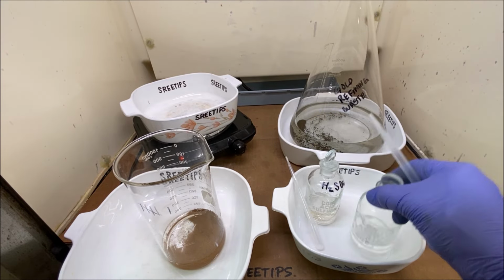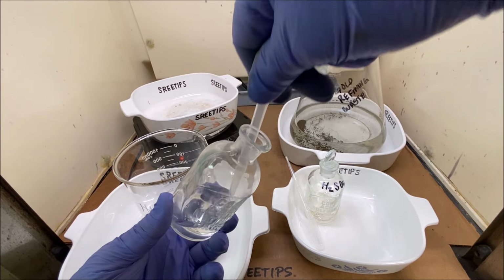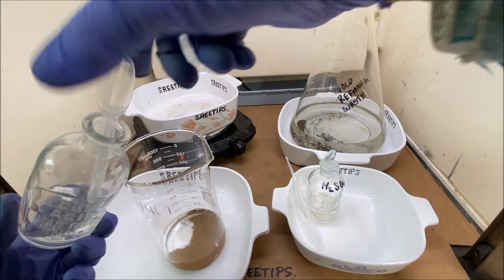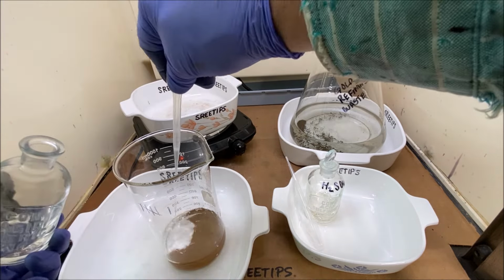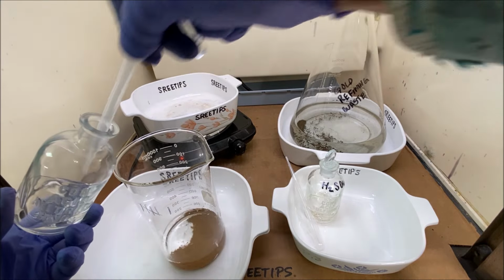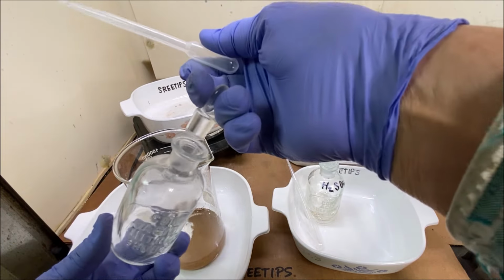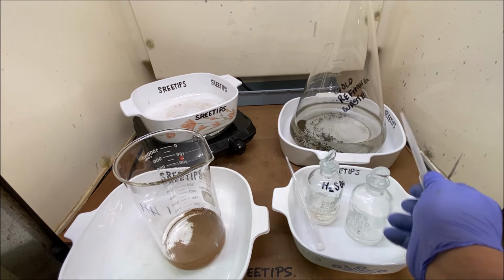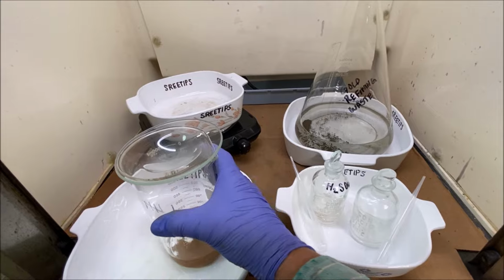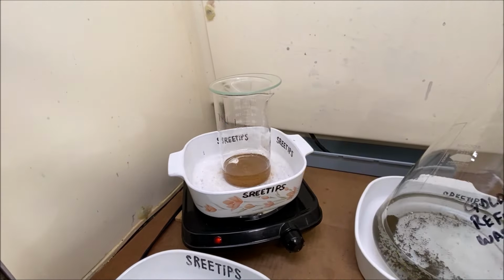Now we're going to put some nitric acid in here. We'll start out with four 3-milliliter doses of nitric acid. Now we'll cover this up, stick it up here on the heat, and dissolve the gold a second time.